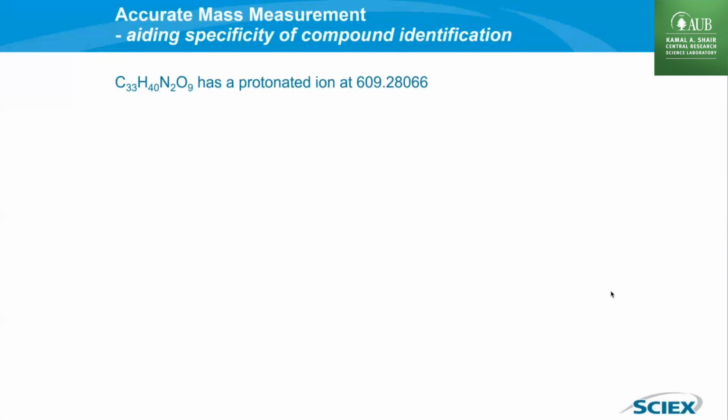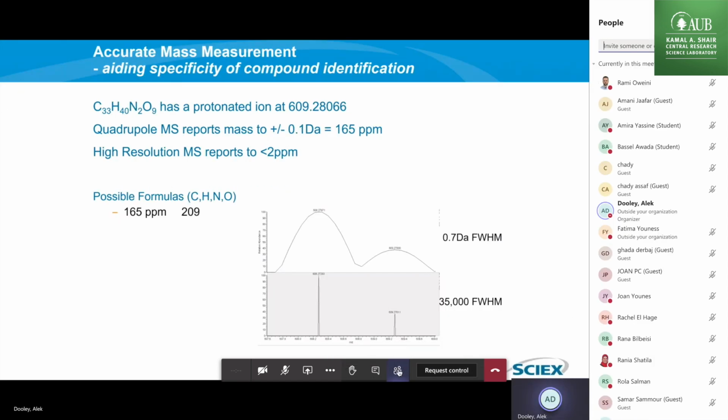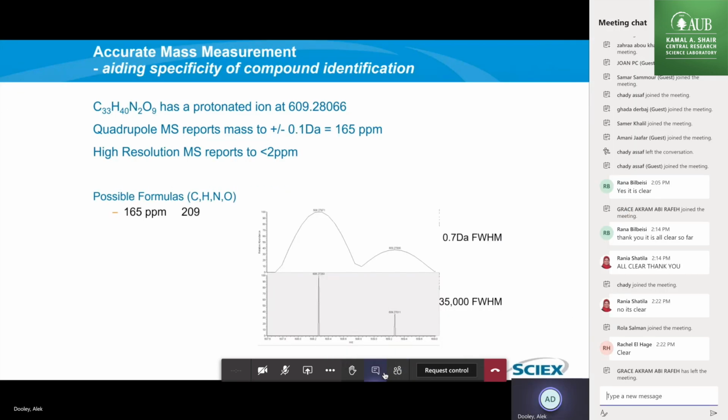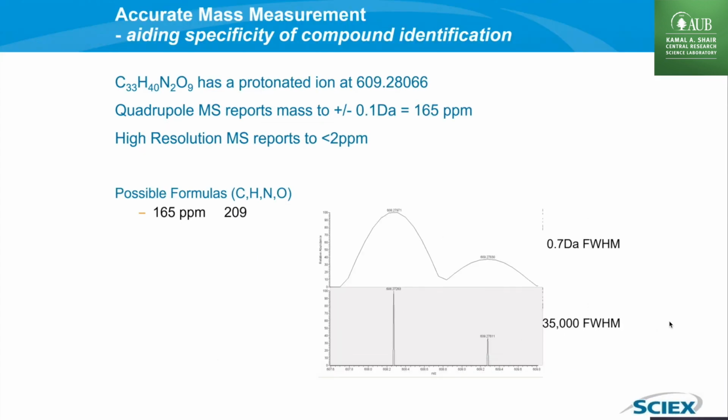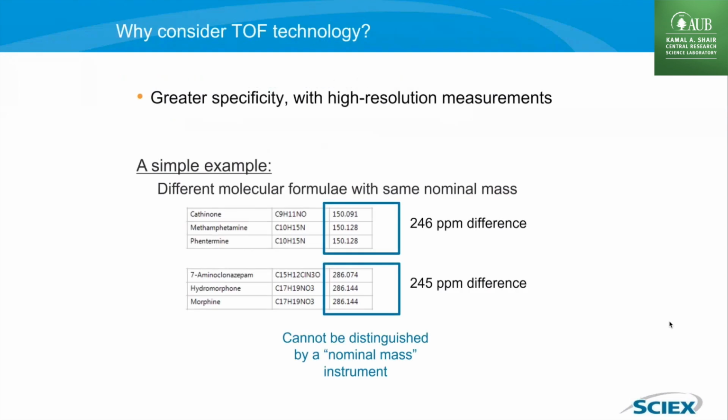So we'll go through some examples now of, let's say, the reverse. This is sometimes a little bit complicated for people, but the data can work in 2 ways, right? So actually, if I just go back and talk about this for a little bit more. Here we would be taking the formula and matching it to the data, right? So we have the formula, we want to search for cathinone, for example.